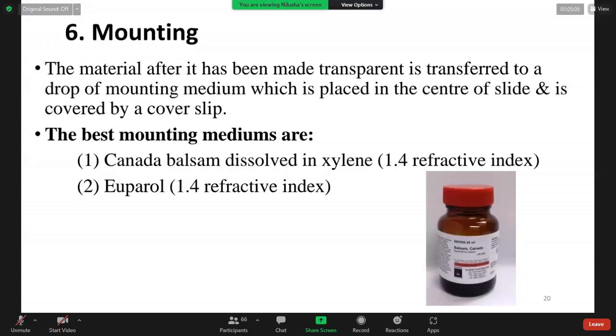Why do we go for the poisoning? To prevent the specimen from insects. We have to apply some insecticide, because the specimens may be destroyed by beetles or any other insect, so we apply some poisoning agent.